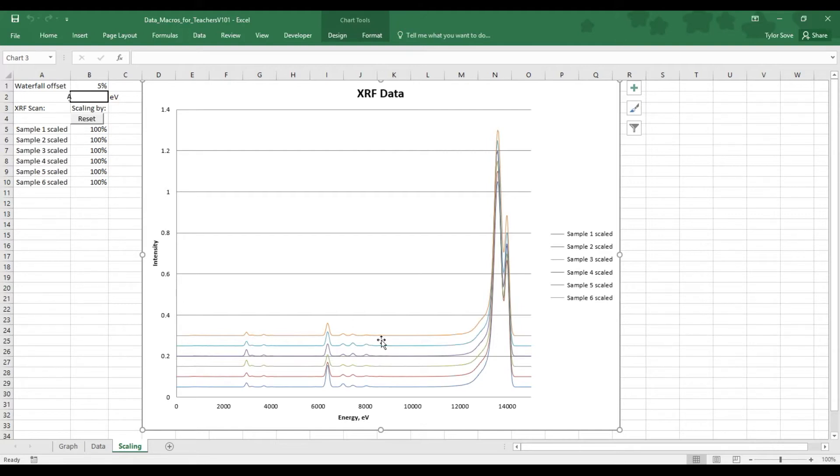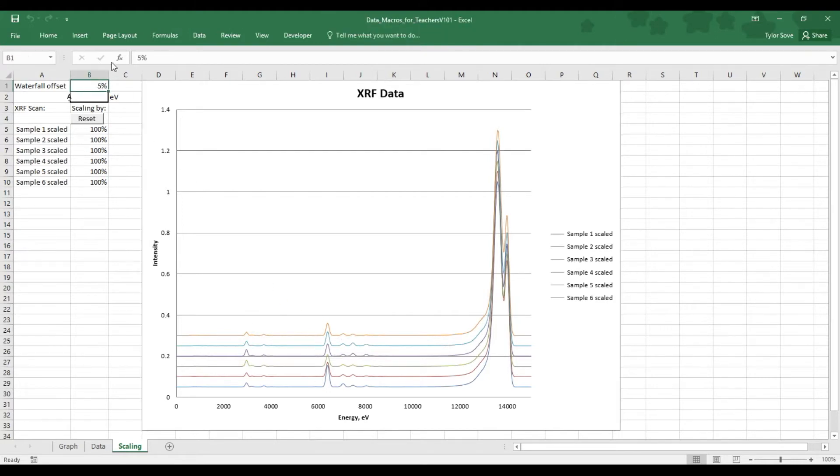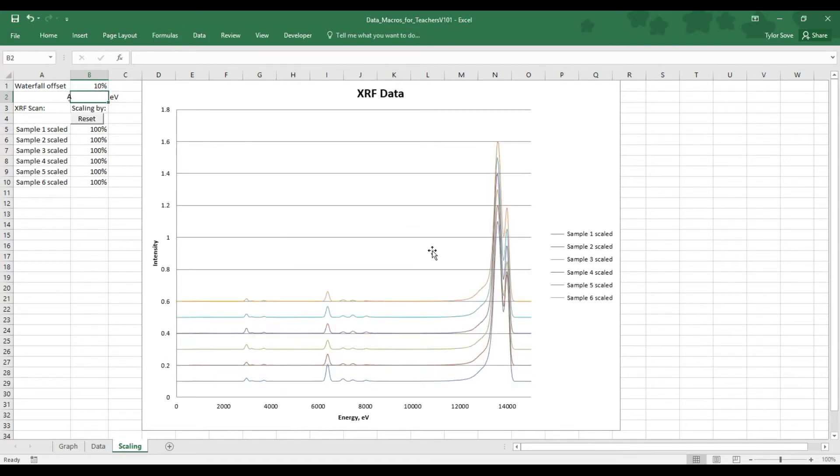The offset allows us to separate the data from itself. If we want to separate it further, we'll go up here to the top left, to this waterfall offset value, and we'll enter in a larger number. We can see that this data has pushed itself further apart.